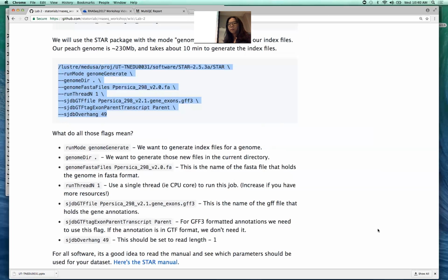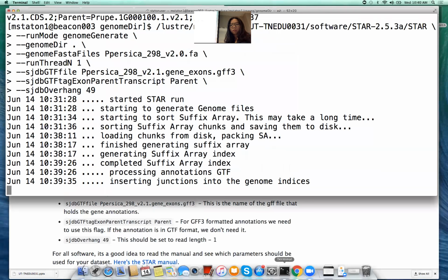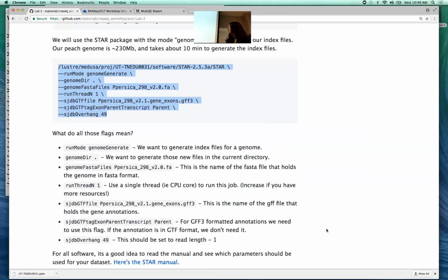Producing the de novo assembly is its own separate, crazy different process. But once you have your reference transcriptome and you have your reads, you map back to the reference in the same way. If you have a reference transcriptome, you actually don't have to worry about introns, because you didn't sequence the introns. So you can use a regular short read mapper instead of an RNA-specific short read mapper. STAR will work just as well. So for teaching, you can use STAR, it would be great.